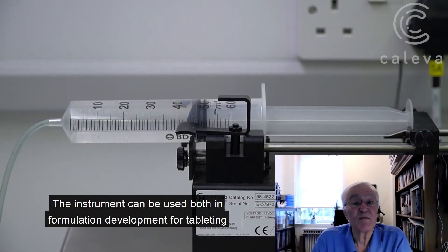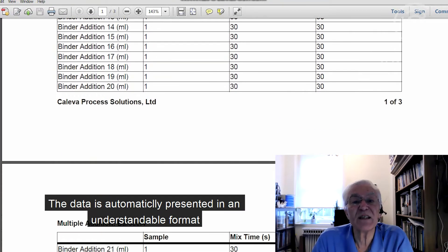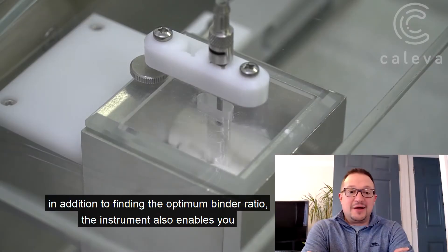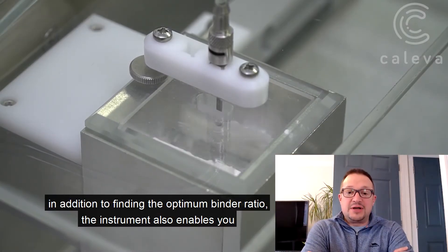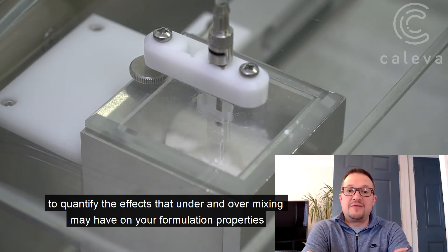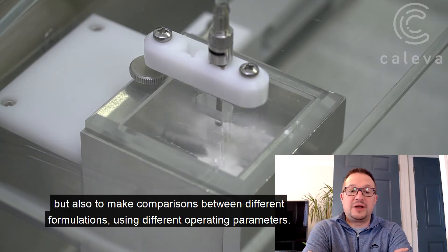The instrument can be used both in formulation development for tableting and formulation development for extrusion and spheronisation. The data is automatically presented in an understandable format and it's easy to share it with your team. In addition to finding the optimum binder ratio, the instrument also enables you to qualify the effects that under and over mixing may have on your formulation properties, helping you not only to determine the correct end point of your formulation, but also to make comparisons between different formulations using different operating parameters.